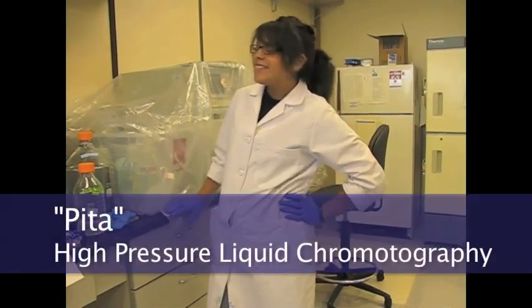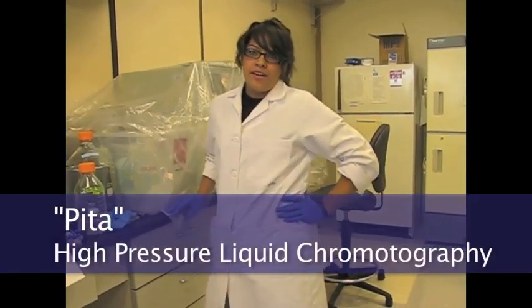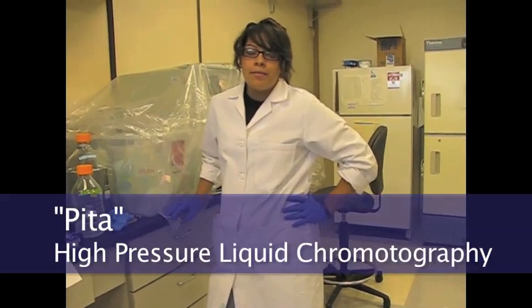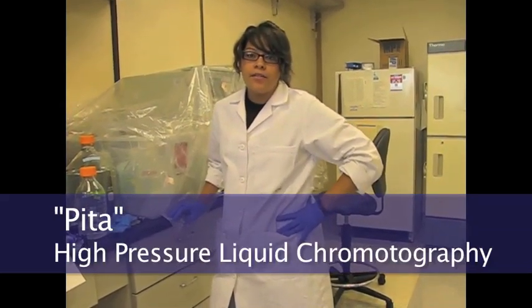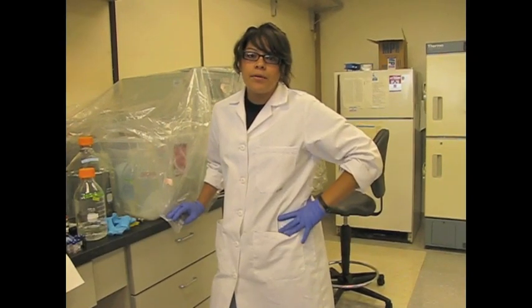Hi, I'm Lupita, and this is the high-pressure liquid chromatography. It is used in many biochemistry and analytical chemistry labs, and it is a form of chromatography that can identify, quantify, and purify each compound. This chromatography separates the compounds in a sample based on size.